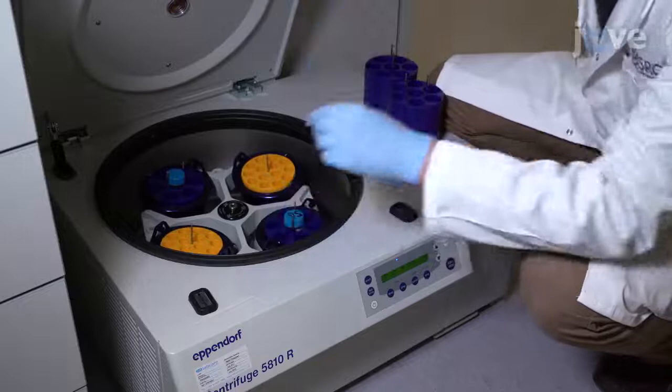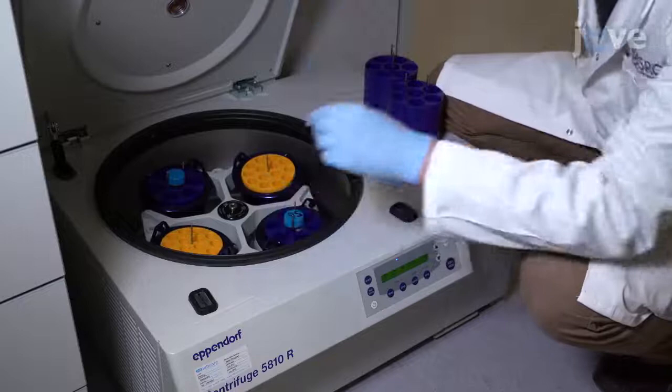Next, centrifuge the suspension cells at 760 times G and 4 degrees Celsius for 5 minutes. Remove the supernatant and resuspend the cell pellet.